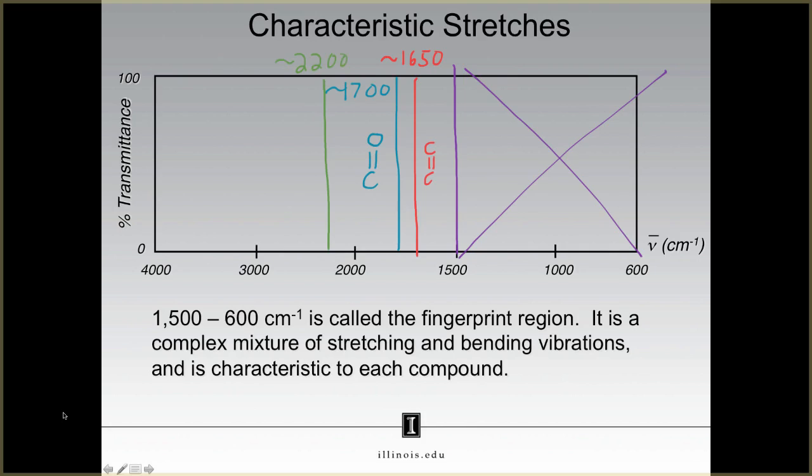Here, we will find carbon-carbon triple bonds. But there is a caveat here. If you look at the table on your lab notebook cover or on the course website, you will notice that for the carbon-carbon triple bond, it says that the signal might be weak if the carbon-carbon triple bond is too symmetrical.